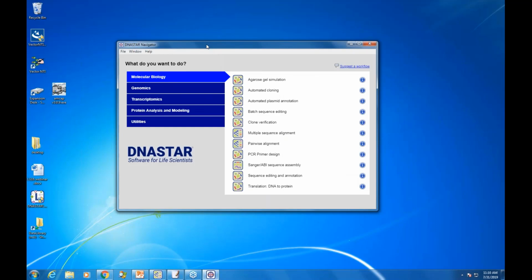And we've changed it. For those current customers, the navigator was really more of an enhanced start menu. It had a list of our applications, and you would organize by similar categories, and it had the product names for individual applications. And really, as we're moving forward, we're actually reducing the number of our applications and really focusing more on specific workflows. So, in particular, new users can find what they're interested in and be placed in the software at that point that they're interested.